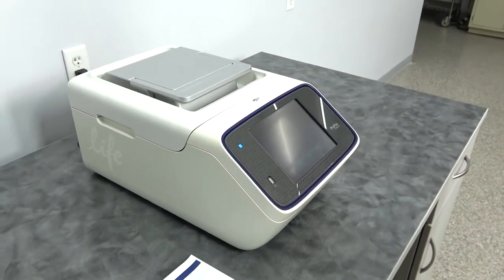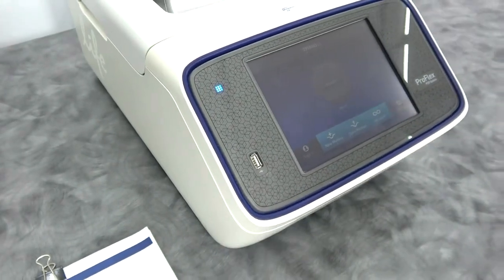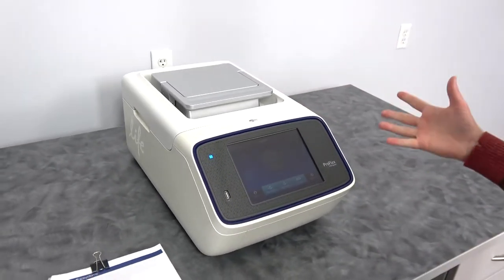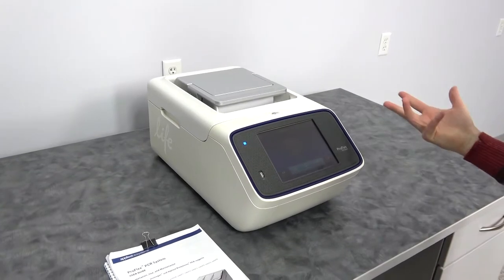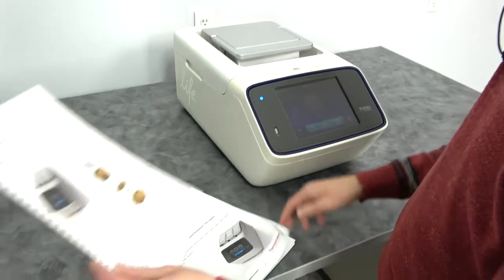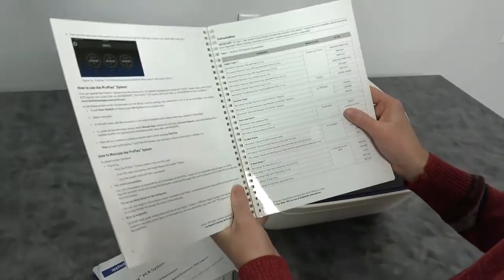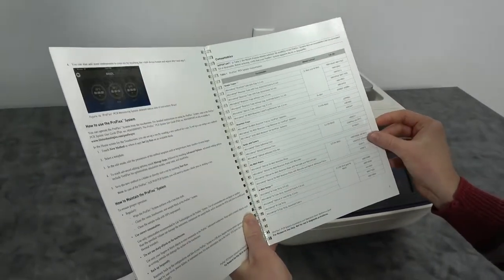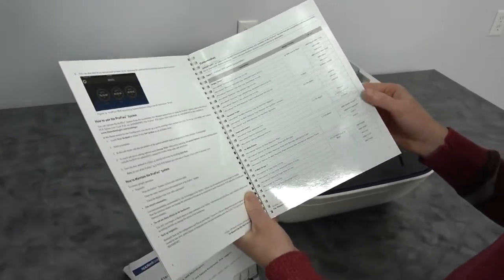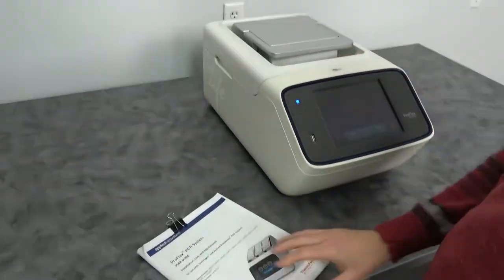Some simple outer features worth noticing: it's got a USB port so you can export your run information. There is a USB port in the back intended for a Wi-Fi card communicator. This also includes a little quick reference guide, which includes some token information about consumables that you might run on this instrument, and it talks about them in relationship to what well block you're running — 96 well, 32 well. Handy information.